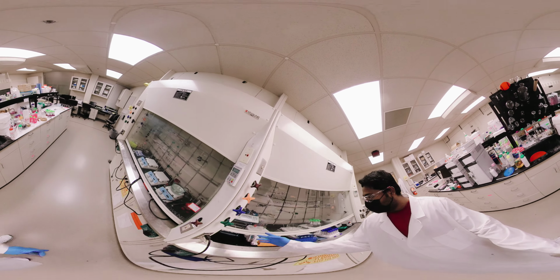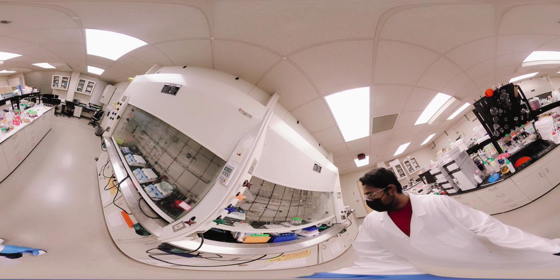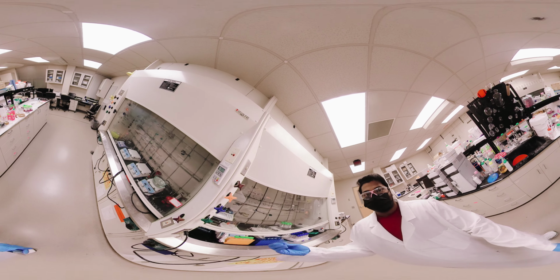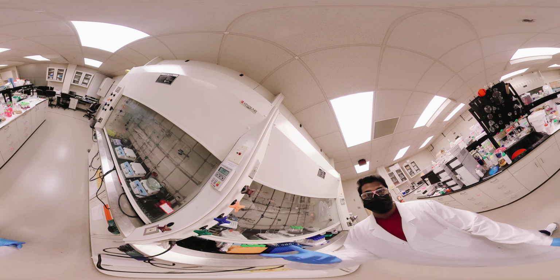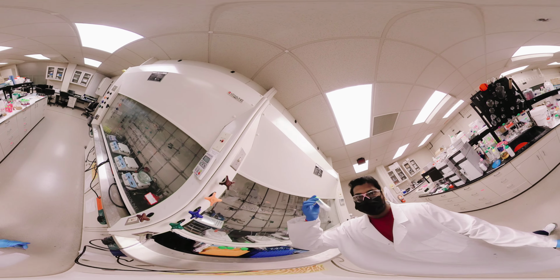We also have a pump, which is called a syringe pump. We are preparing different kinds of polymer beads from this syringe. You can see over here this kind of beads we are using, and we are loading some drug and applying them for biomedical applications.